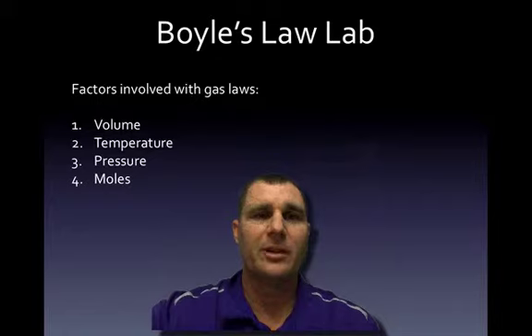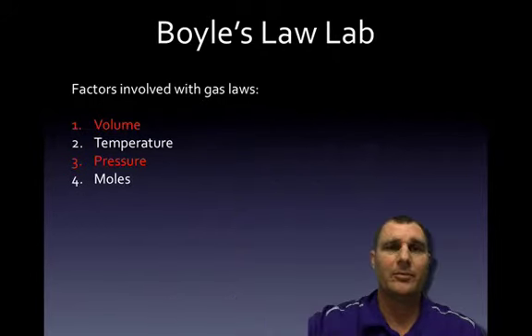If you remember from previously, the gas laws have four specific factors that we're studying and the relationship between them. Boyle's law specifically deals with the relationship between volume and pressure and how changing the volume directly affects pressure. So let's go ahead and get started.